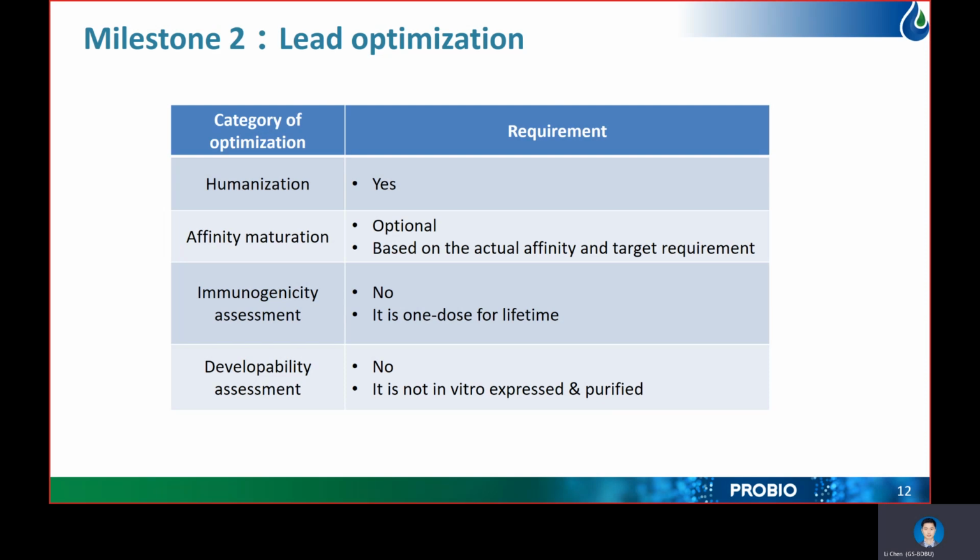Once the lead candidates are identified, the next step is sequence optimization. Typically, the following 4 parts of work will be considered for therapeutic antibodies. However, it is not necessarily the same for CAR lead antibody. Humanization usually is a must-have since it can greatly reduce the overall immunogenicity with relatively low costs and risk.